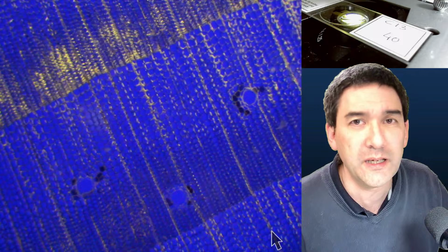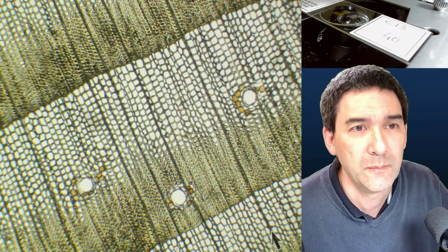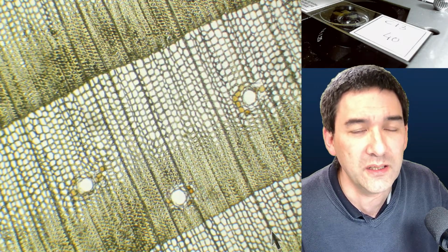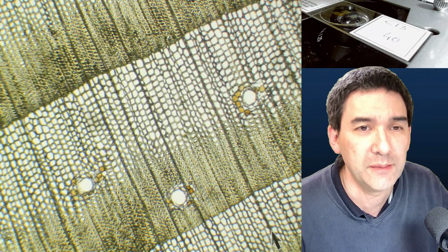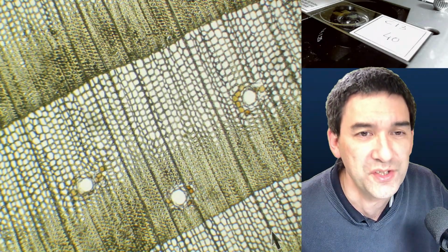And you probably want to see how this looks in original. And that's how it looks in original. Again, you might say there are more details visible here. That might be, because I'm also closing the condenser and this increases the contrast.